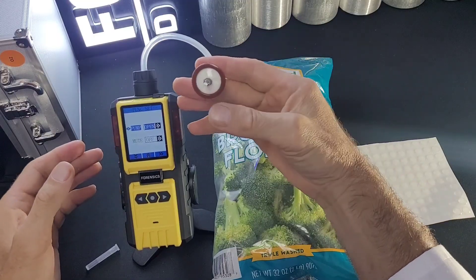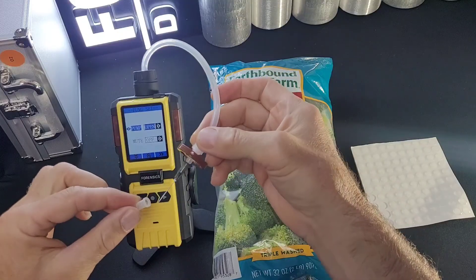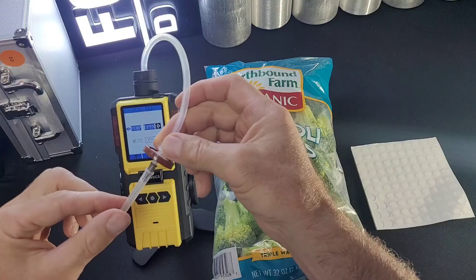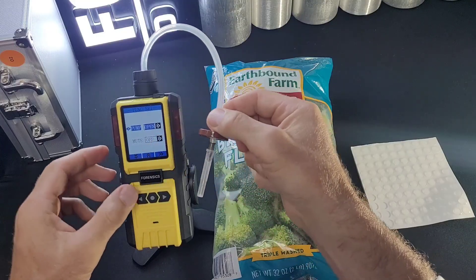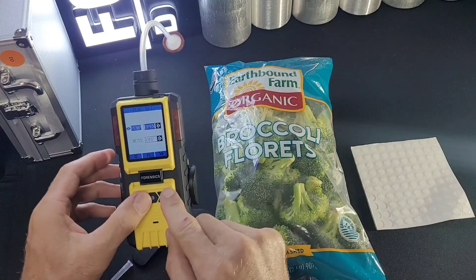Be very careful always with the needle. When you're not using it, please put on the cap. We don't want any accidental stabbings or anything like that. I will leave it off just for the minute, and then I'll undertake my analysis.